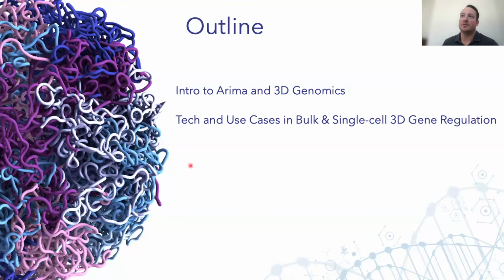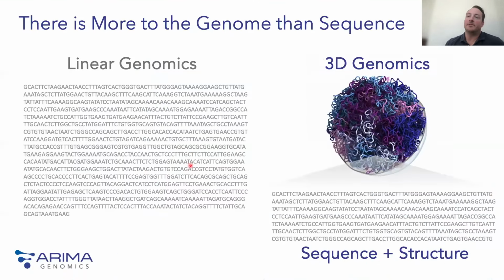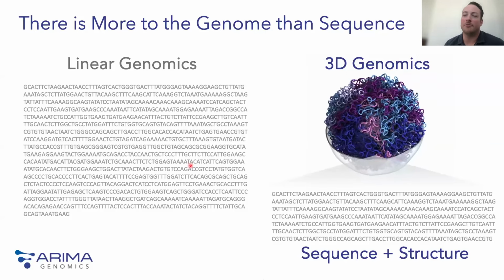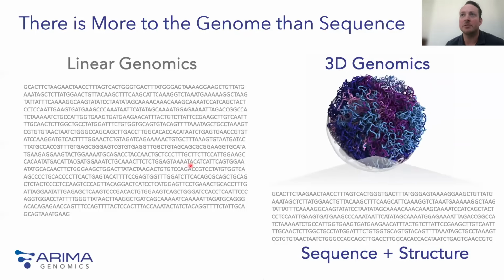I'll talk a little bit about 3D genomics, the technology, and the use cases, really starting with bulk 3D genomics, and then going down into single cell. So by 3D genomics, what do we mean by that? If you've attended these webinars before, or if you're familiar with 3D genomics, this will be already known to you.